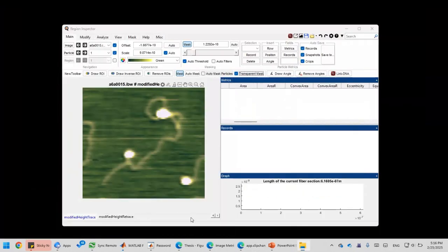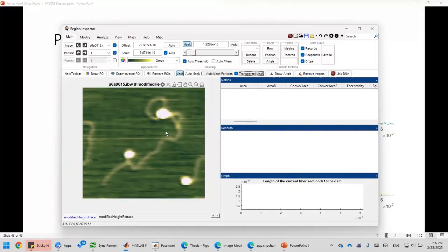Let's first open up Region Inspector. Now this is the same molecule that we're looking at. So first, let's click the molecule to produce a trace. And let's drag the first point to one end of the DNA. And then let's add another point midway. So by double clicking here, let's choose the path upwards and then double click here. All right. So once we have that, as you see, we have only 2 peaks.